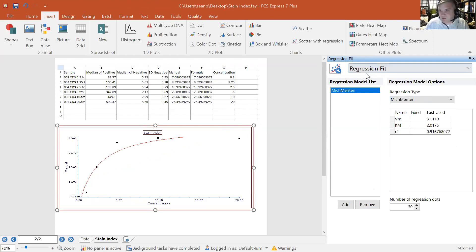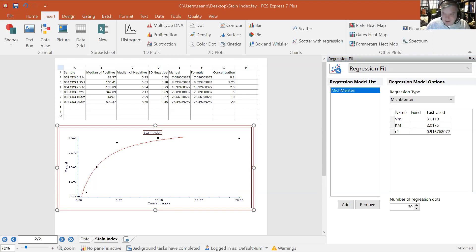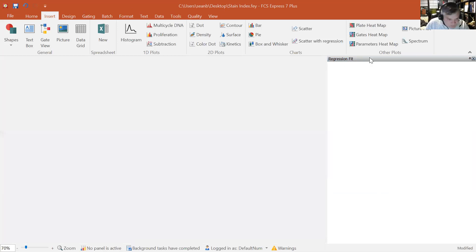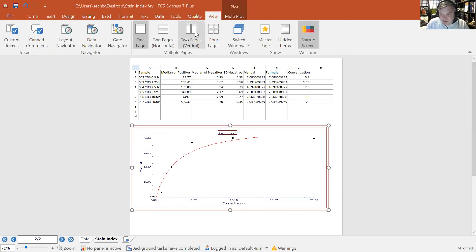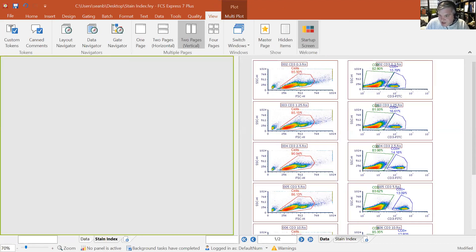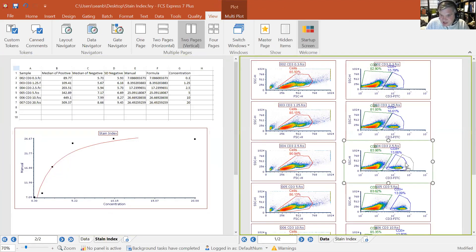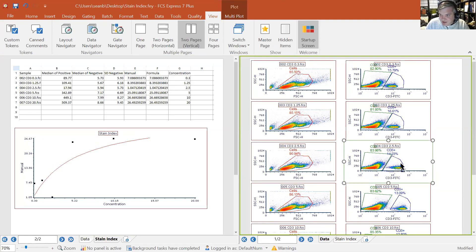FCS Express doesn't automatically determine the best curve fit — the default is a linear fit. To change the fit type, go to Regression Fit and choose from options like Michaelis-Menten, 4PL, or 5PL. You can compare multiple fit types and view their R-squared values. In a two-page view, moving a gate on page one updates the stain index regression plot immediately, letting you see what gate changes do to the analysis in real time.